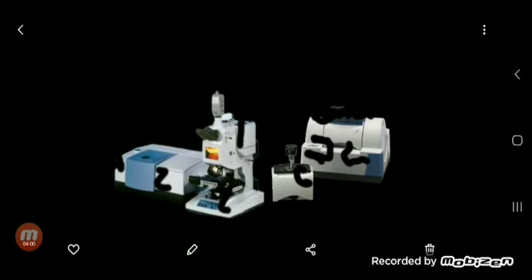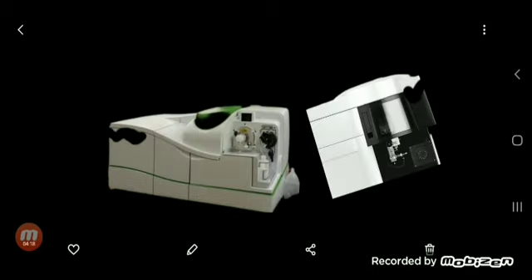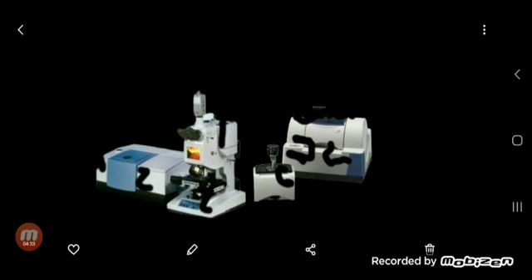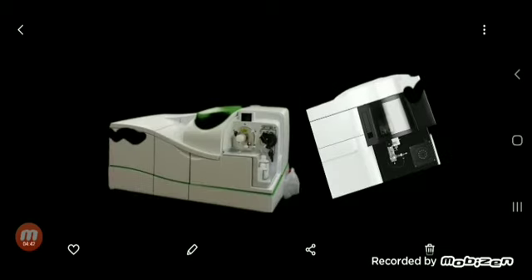We are using digestion processes in ICP OES, an abbreviation for inductively coupled plasma optical emission spectroscopy. This is the instrument which is famous in analysis of metals at low concentration, reaching the ppt, I think, or even lower, and FTIR is mainly for organic. And for the oil method, we can reach ranges of 0.2 ppm or less, minimum detection limit.